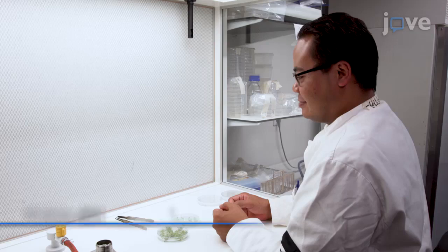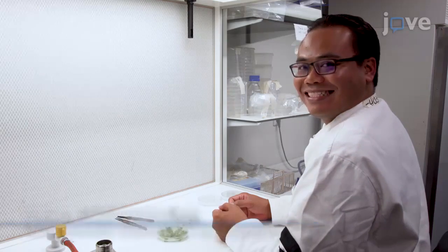Demonstrating the procedure will be PhD students Titus Wardani and Judah Roswanjaya, together with Marijke Hartog, a technician in our lab.